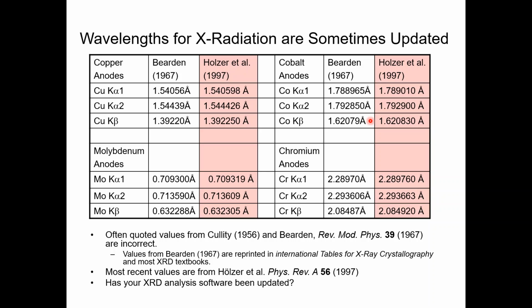And you know that for XRD we also have XRD software that is used to update the values of these X-rays according to the most recent research.